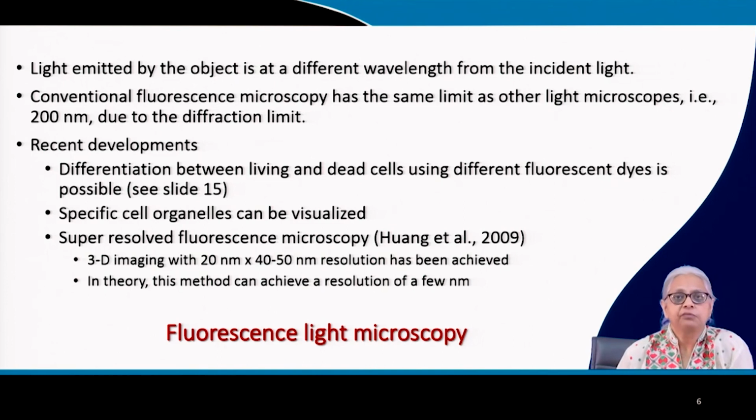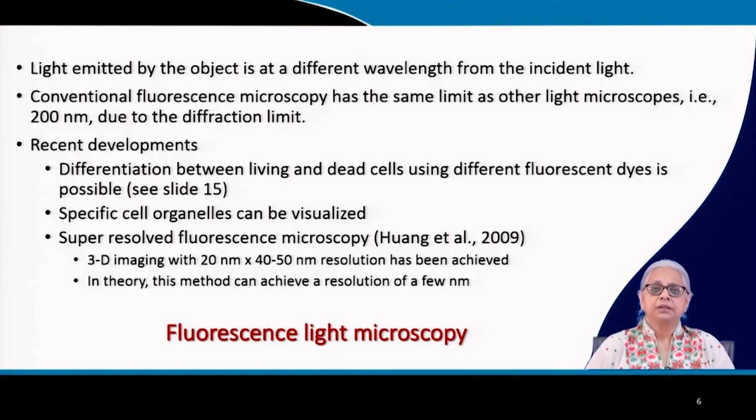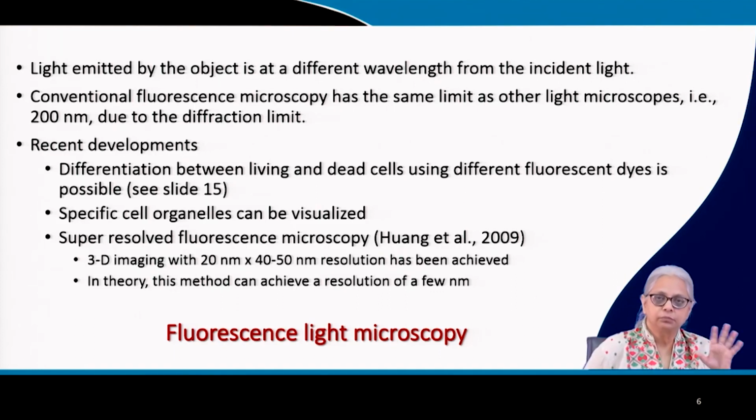Some of you may be familiar with the natural fluorescence of chlorophyll. Now, we know that under sunlight conditions, if any cell has chlorophyll in it, it looks green. We are all familiar with algae and so on. In our environments, including plants, all of them have a green color because of the presence of chlorophyll molecules. Now, when I see an object as green, it means that the light can do various things.